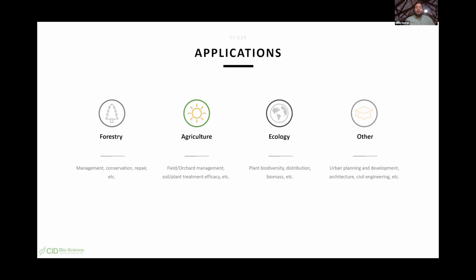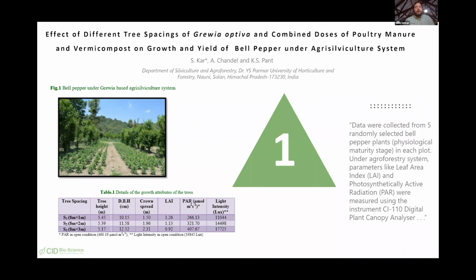So it really isn't limited to just the forestry application, which might be the first application that comes to mind when you think about investigating plant canopies. So hopefully the next 9 studies that I show you, and then the following 2 studies from our 2 guest speakers, will help to show that this instrument has a really wide range of applications. So let's dive right in to our first study that we picked.